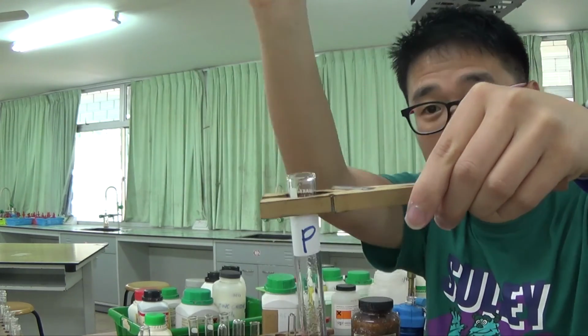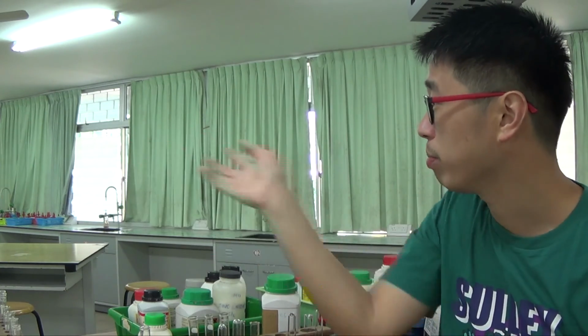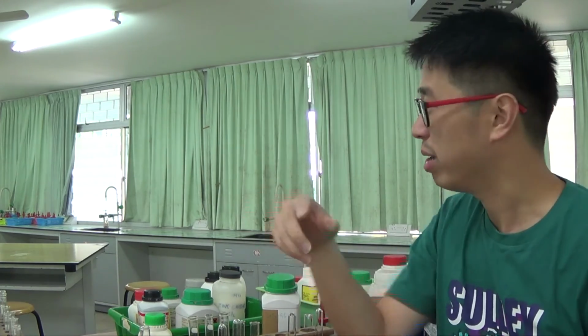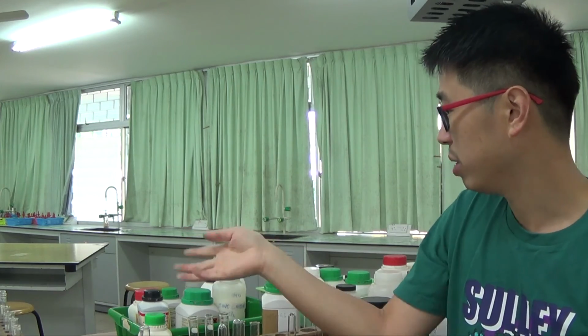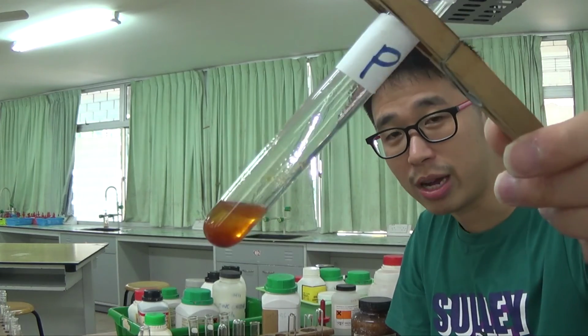Because it will spill very easily and it's very dangerous to the person next to you, which of course you won't be like me today because I'm working alone here, but you have other people around you. It's dangerous, and you might even spill it on your question paper, and that is bad because if it is a real exam, you get 1 question paper per person. You do not want to spill anything on your question paper, alright? So be very careful.